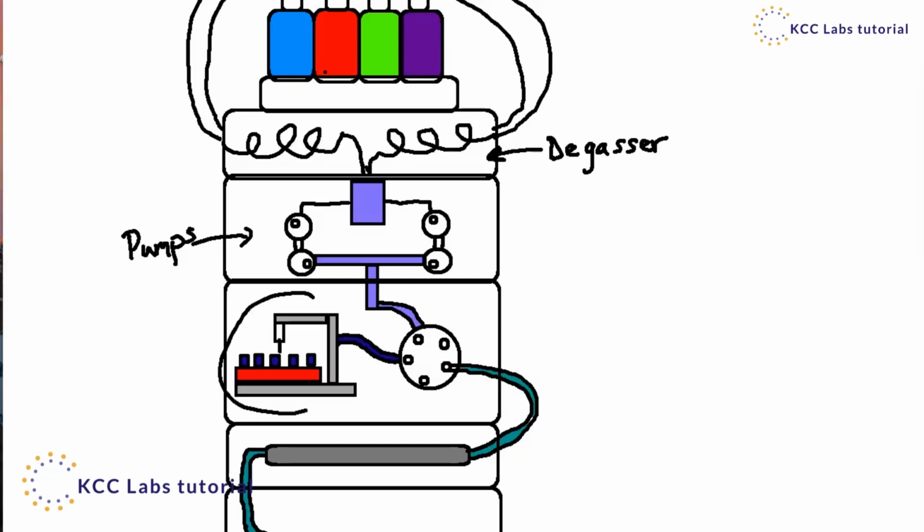You've processed them in a lab. You've been given these samples. You put them into a rack. You load that into the auto sampler, and then through the software, the auto sampler will come and pick up a given amount. You can choose the injection amount. It's usually a tiny amount, like 50 to 100 microliters, excuse me. And that will send this material right into the injection port, where it will also meet up with the mobile phase, and that will be sent down into the column.